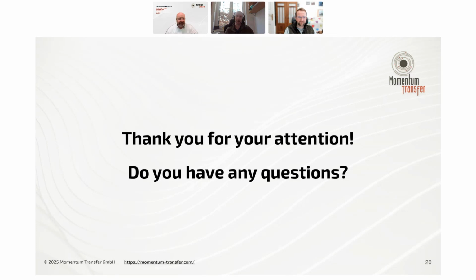And I always use this method. So I have sub-libraries of candidates that have been sourced in the search step. And then I'm generally doing a whole profile optimization of the candidate library to see if actually these combinations work together to fit the pattern. So yeah, 100%. You should be doing that.